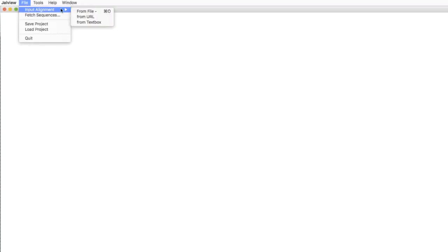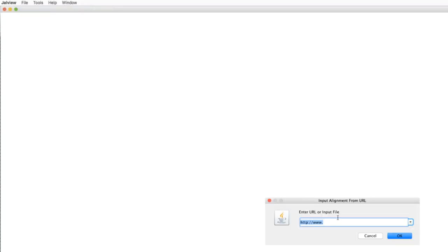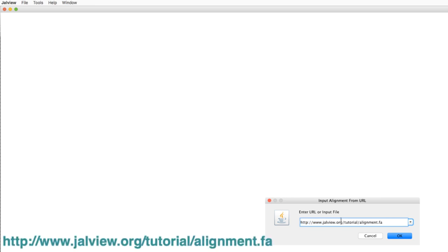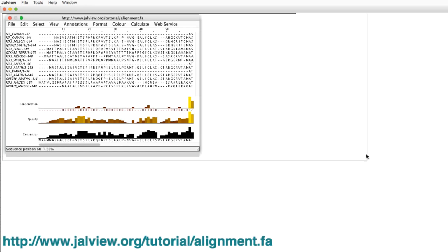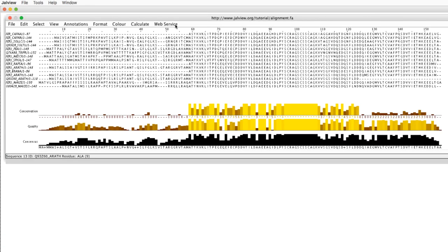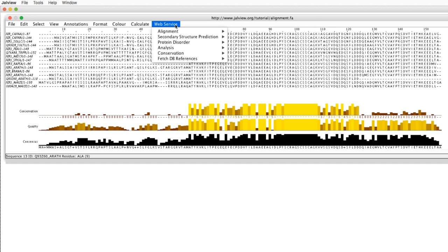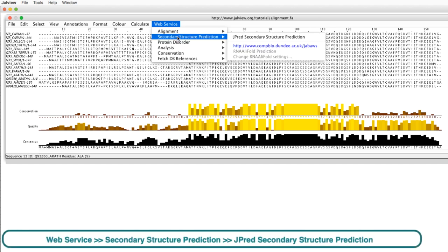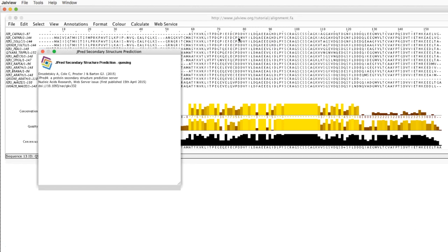For this demonstration, I will import a group of sequences that have already been aligned. The URL is shown on the screen and is in the notes below. JPRED is run by going to the Web Service drop-down menu and selecting Secondary Structure Prediction, JPRED Secondary Structure Prediction.